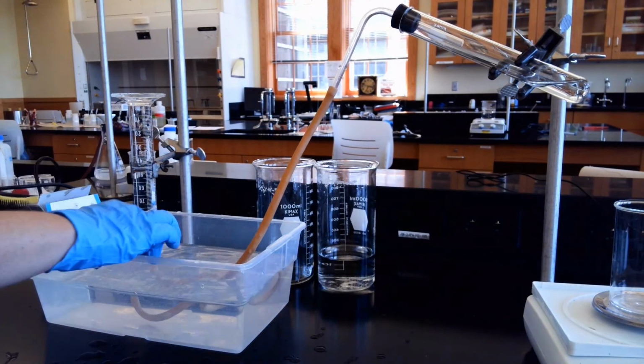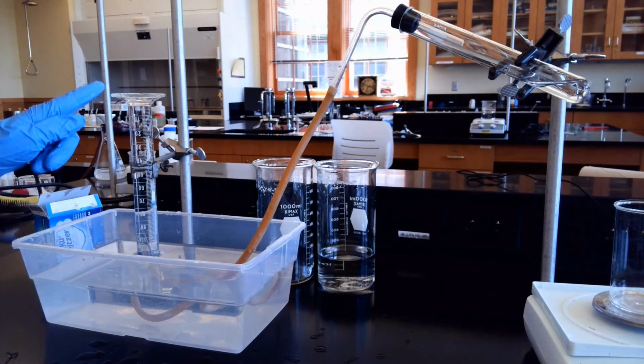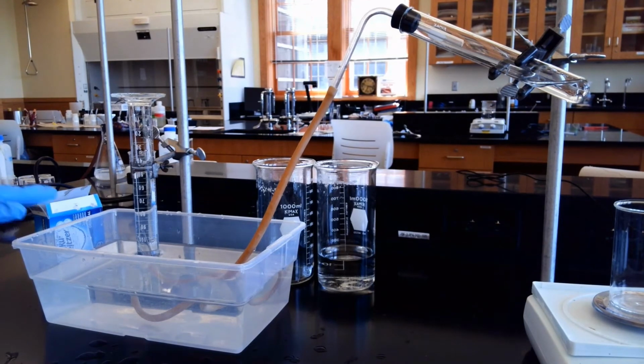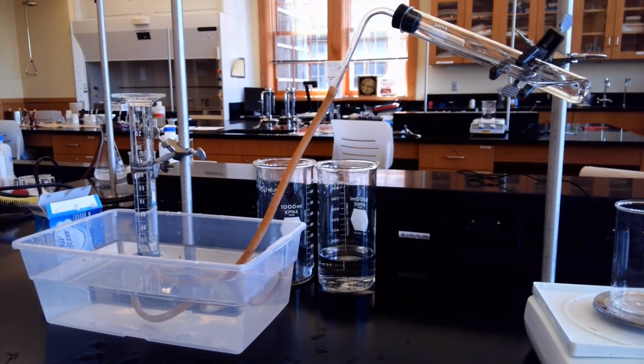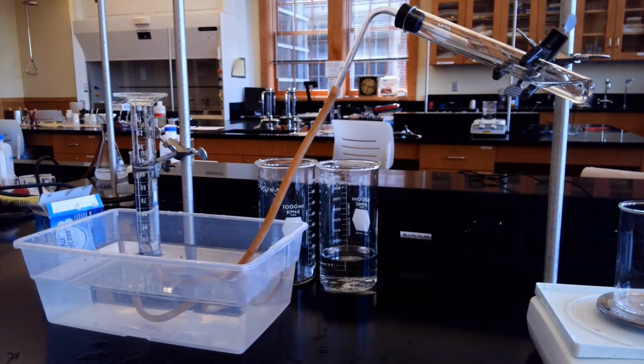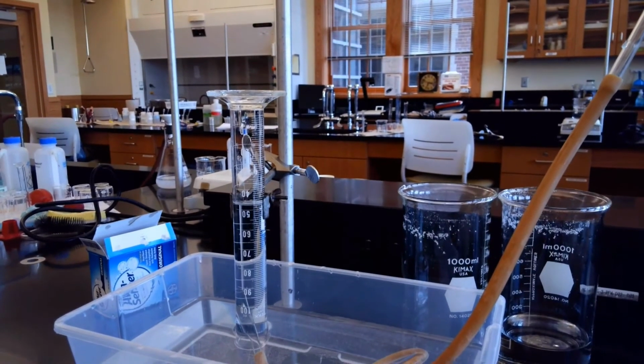Okay, so the next step, all we have to do now is actually just calculate the amount of water. And unfortunately, I cannot push this up to even it out. Would have helped if we used a smaller cylinder, but to be on the safe side, we use this one. So I'm going to try to move you guys closer and move the camera closer.